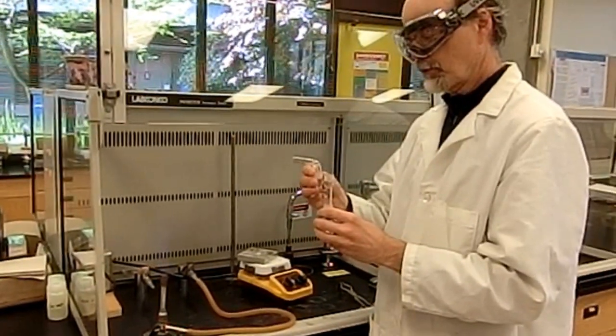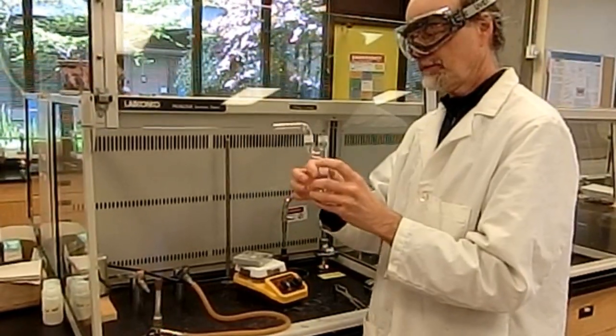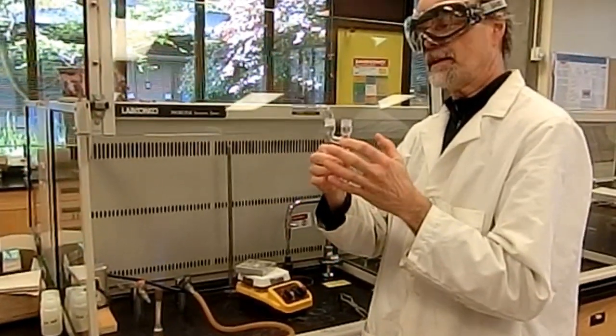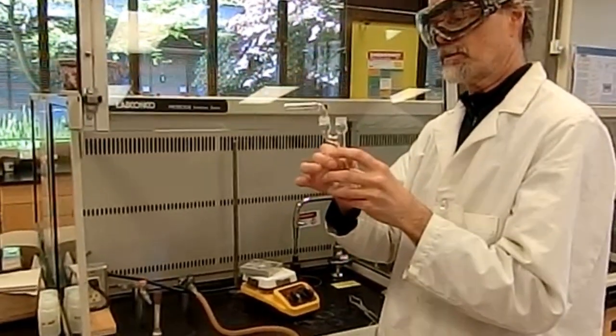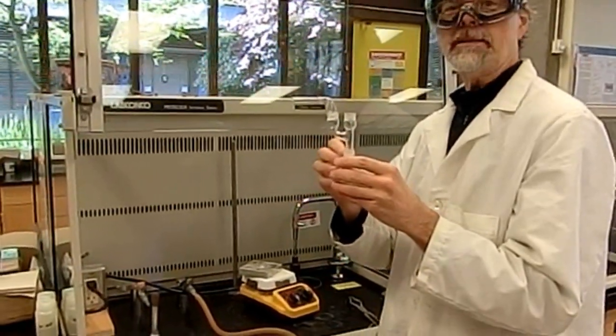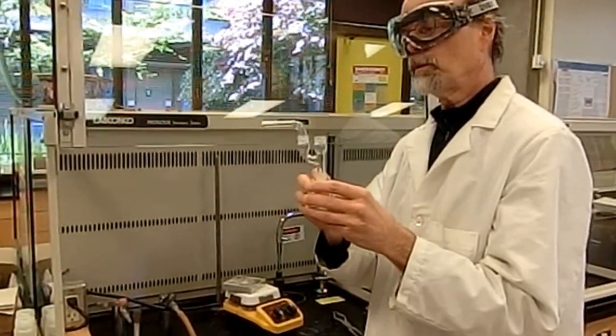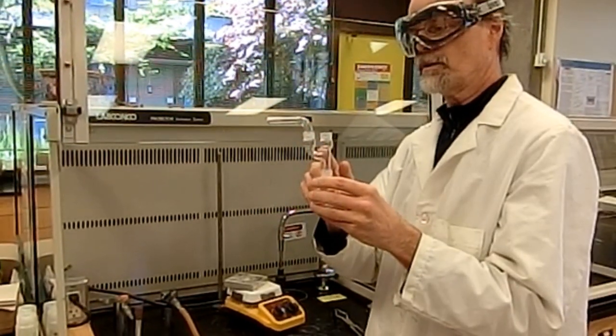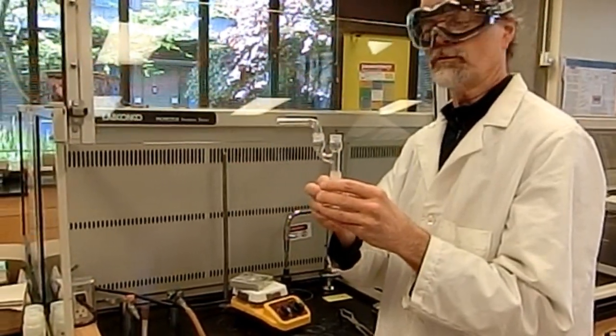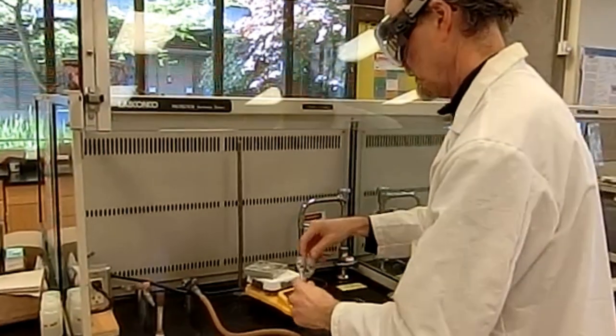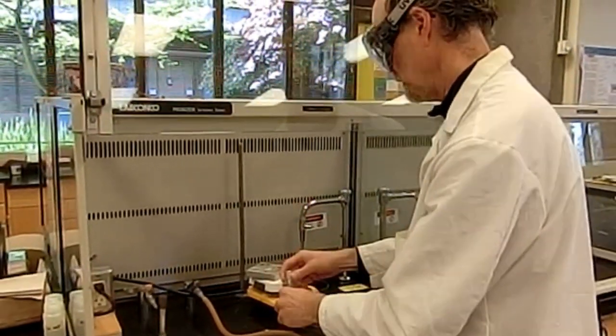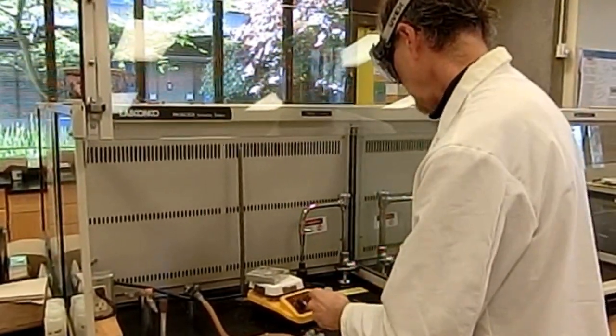So this is our glassware for the Grignard reagent, a round bottom flask, it's called the Claisen head, and then our drying tube adapter on top. Now before we start the reaction, we need to flame dry the glassware because we want to make sure that all the water that is embedded in the glassware is driven out of it. So we're going to attach all this, we have our nice blue flame going, we've got some clamps.